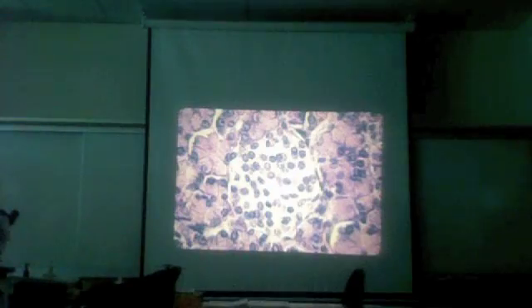What kind of tissue? Not dense regular, not with those squiggly lines. Elastic connective tissue. Where would you likely find it that dense? Densely packed. Wall of the aorta, yeah. What organ?